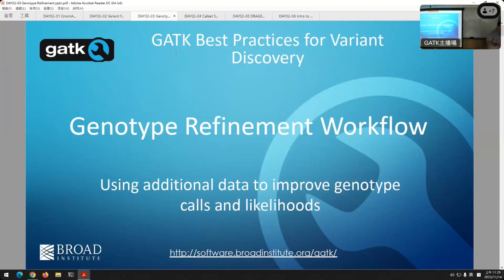For the most part, the problem is with the likelihoods and not with this case. But we saw this case enough. Obviously, it causes a Mendelian violation. So that's the first thing we look at for large deletions. But for the most part, when you see a Mendelian violation, it's an issue not with variant calling, but with the technologies. I'll show you some examples of where things are very strange inside the reads, the sequencing data itself.